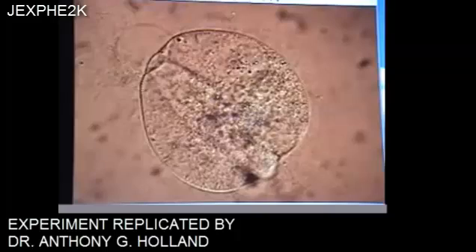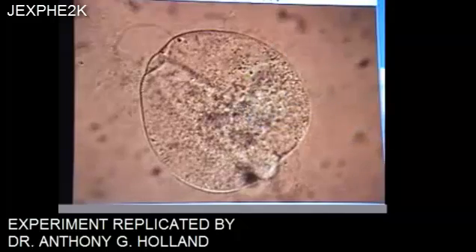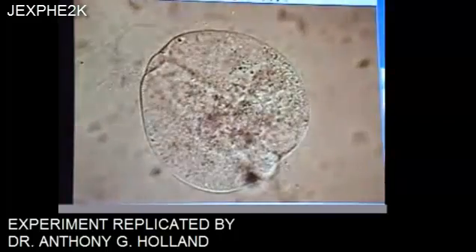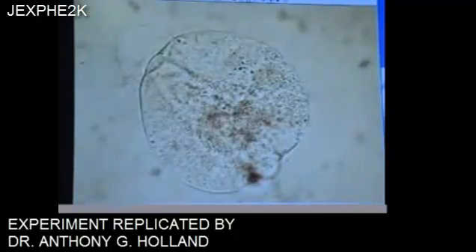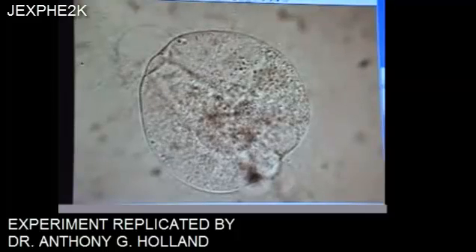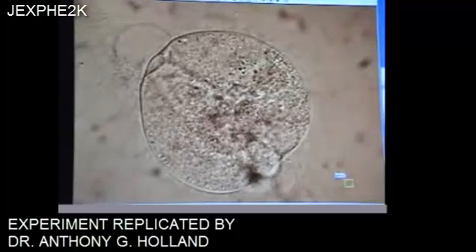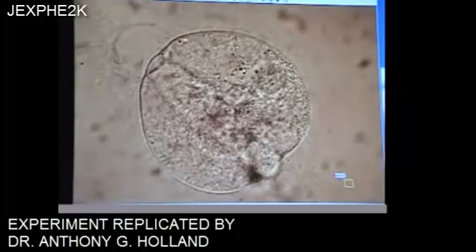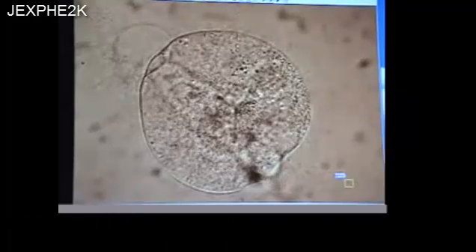There's a lot of activity still inside the organism in this region. You can see with the microscope especially. Once they reach this stage of change where they're very round, what's that, 700 seconds approximately, it takes quite a while before you'll see any further morphological change, but it will happen actually, I think, if we stick on this frequency long enough. It just takes a long time. Yeah, down below he's continuing to expand.